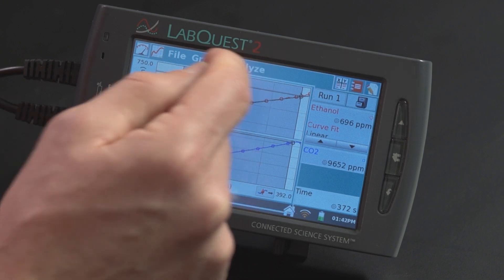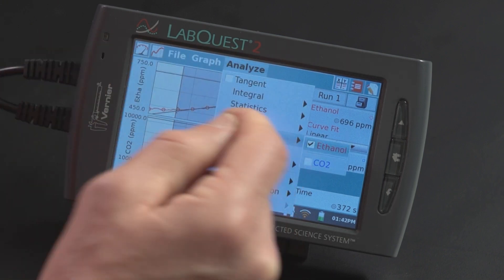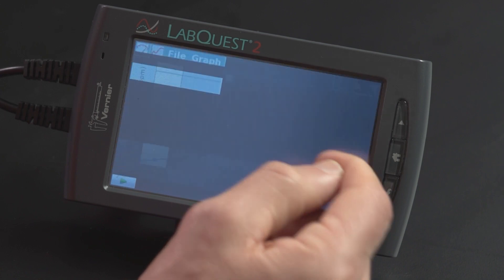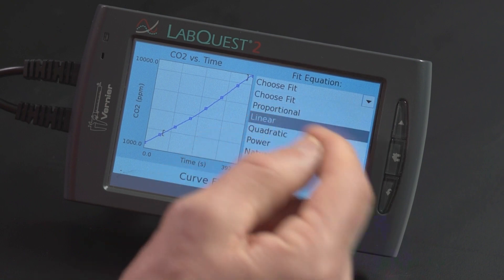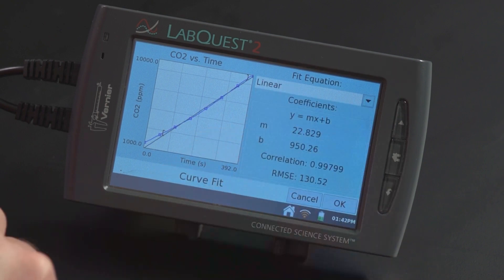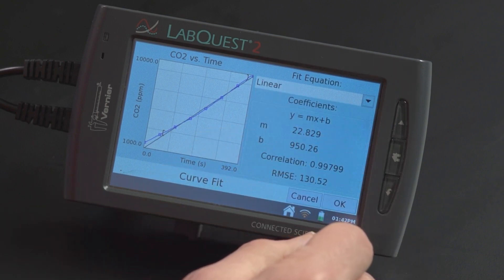And then I can do the same thing for the CO2. I just go back to Analyze, Curve Fit, select CO2, pick my fit, which for most things that we do in biology is going to be Linear. And you can see the slope is about 22.